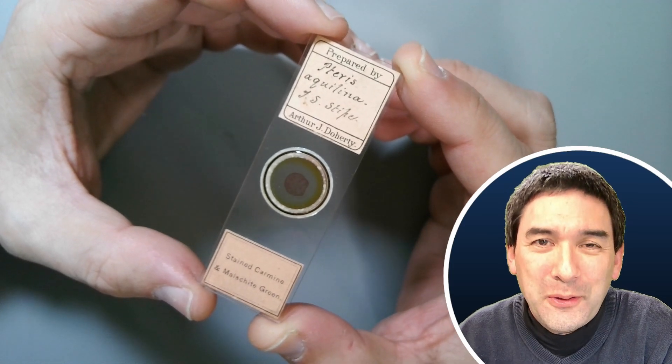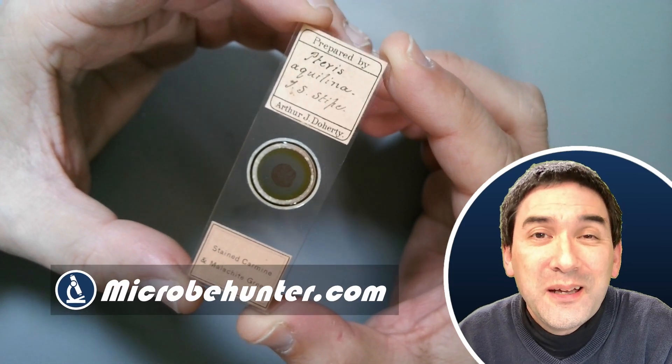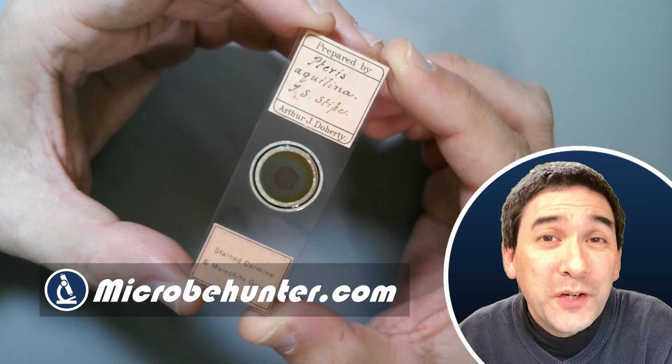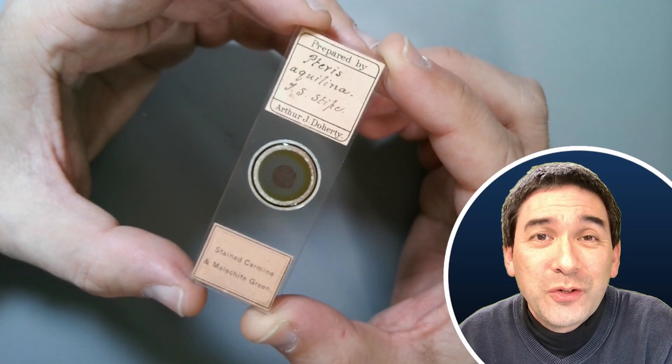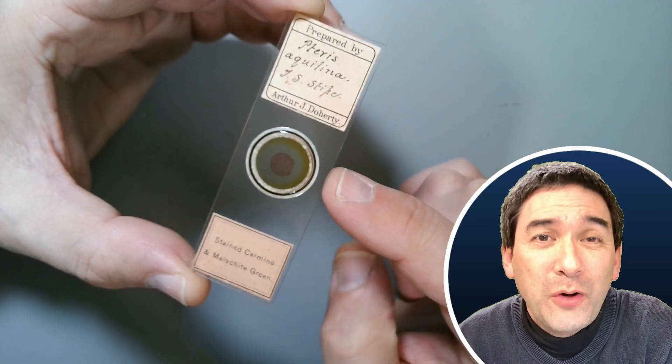Hi, hello and welcome. Microbe Hunter here. This here is an antique microscope slide. It is over 120, maybe even 130 years old and it shows the cross section of the stem of a fern.